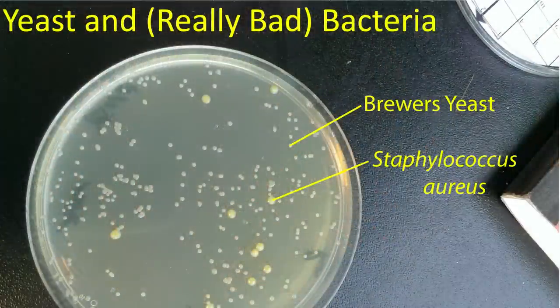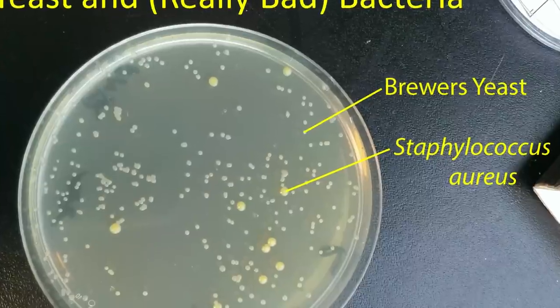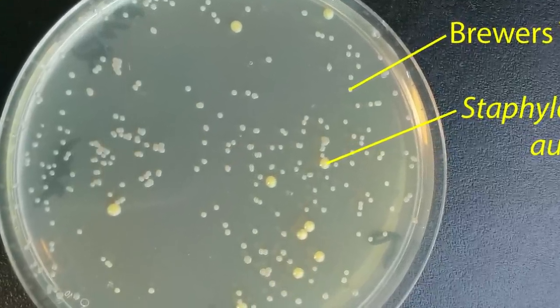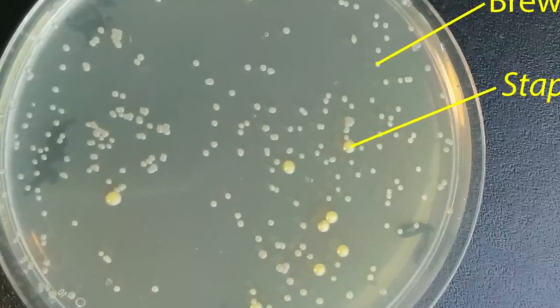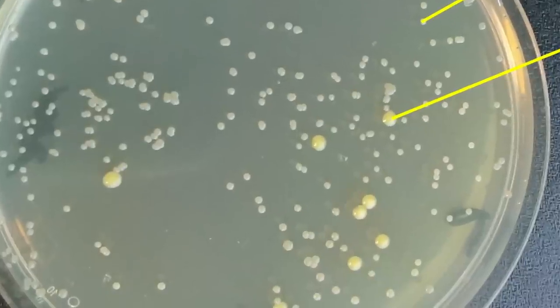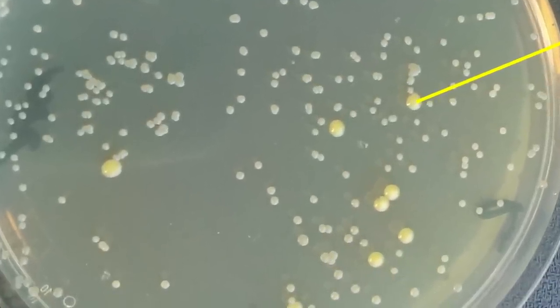This is a different plate I deliberately set up to give an example of something that doesn't look very safe. The white colonies here are just plain old brewer's yeast, nothing fancy. Those golden colored colonies are a common bacteria that many of us have in our noses and on our skin called Staphylococcus aureus. This is a normal part of our skin flora, but it can cause very serious infections — both food poisoning as well as lethal infections of our tissues and lungs. So if you ever see something golden on your plate, you want to avoid it.